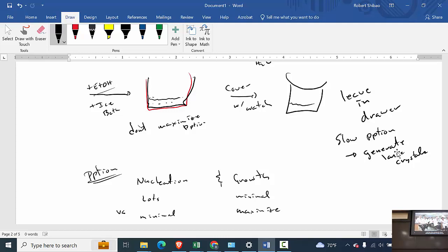All right. In this lab, we'll be working on various individual experiments, so make sure you read all the bottles of reagents carefully before you start using them, okay? I always get confused about the order of addition. Is it water to acid or acid to water? I never understood it. It's easy to remember if you know the reason.